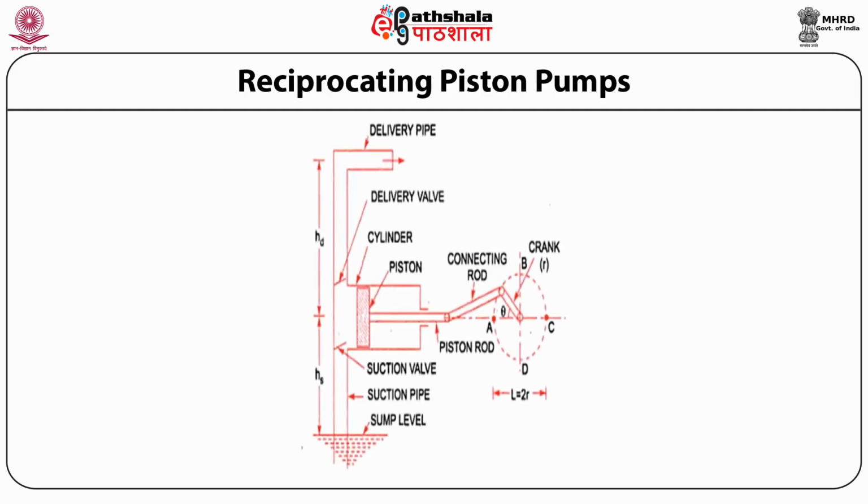Another type of pumps are reciprocating piston pumps. In these pumps, through reciprocating motion of a piston within a hydraulic chamber, a motor electrically drives the piston back and forth. During the backward stroke, the piston sucks in the solvent from the reservoir, and during the forward stroke, it delivers the solvent into the column. The check valves are enabled that close the column outlet while aspirating the solvent in backward stroke and close inlet from the reservoir during forward stroke. Flow rates can be fixed by adjusting the piston displacement.